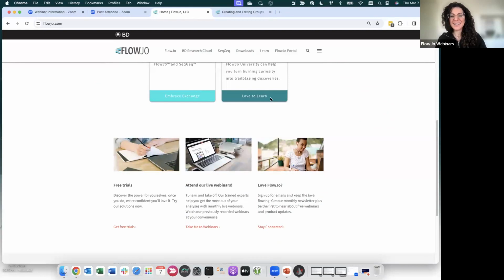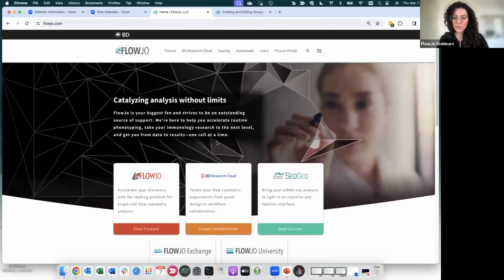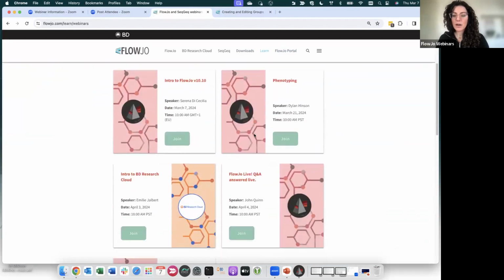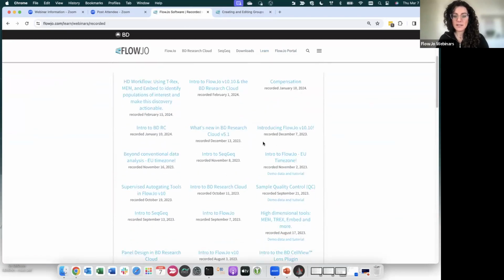Could you explain the tSNE? Dear Veronique, I would love to explain the tSNE. It's one of the topics that I love most, and I can invite you if you want. I gave a webinar a few months ago on beyond conventional analysis that shows different algorithms such as tSNE as well.